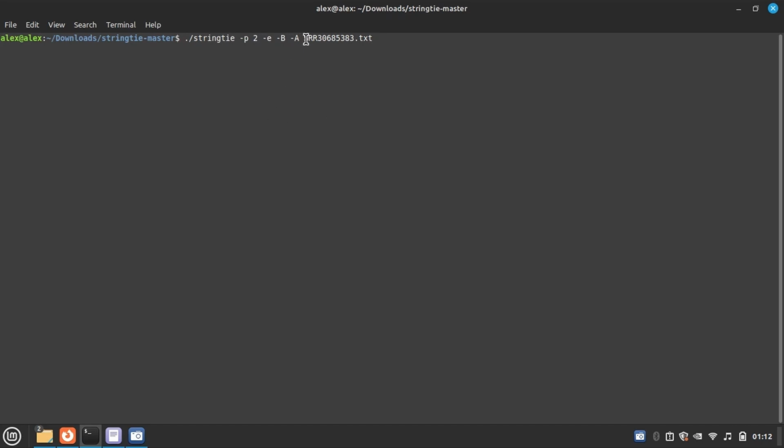This is the entry name, the ID, and txt file. It will be the output of the expression, and after that I have to use the genomic file, the GFF file. So it is cerevisiae gff3, and then come with -o, the output, and the output file will be the same as the file name 83 and .gtf.